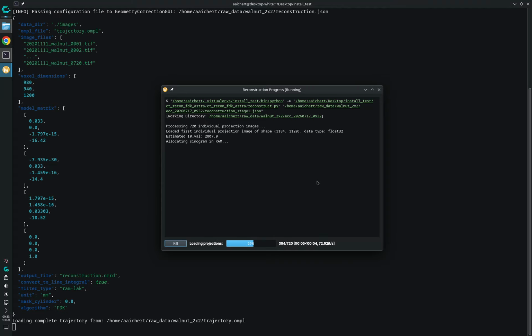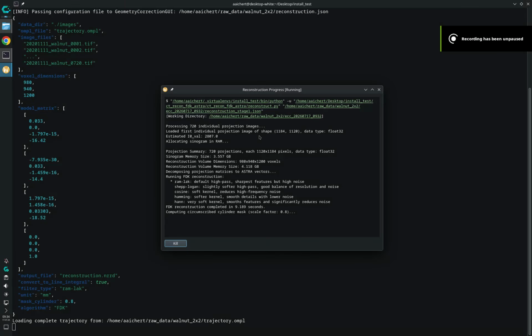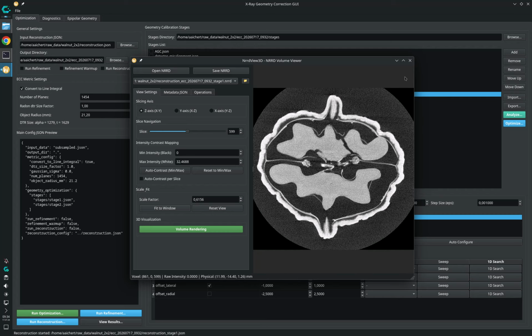I'm just going to pause the video again. And there we go. Yeah, well, just writing and loading this dataset also takes a bit of time because it's 4 GB each time. So maybe I should have unpaused a bit later.